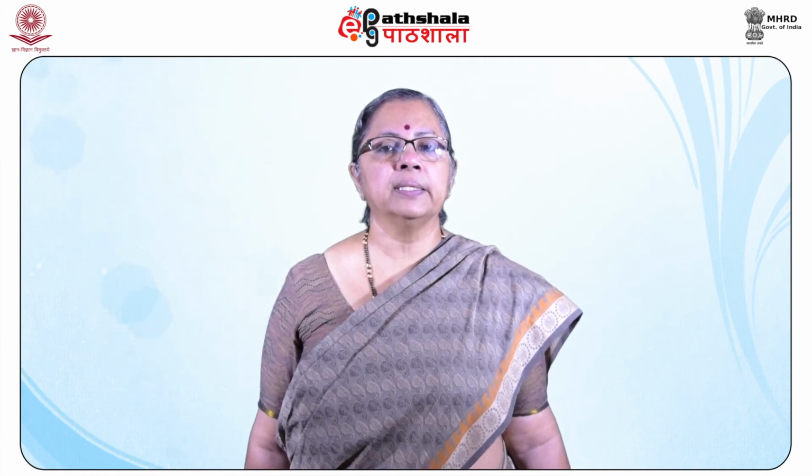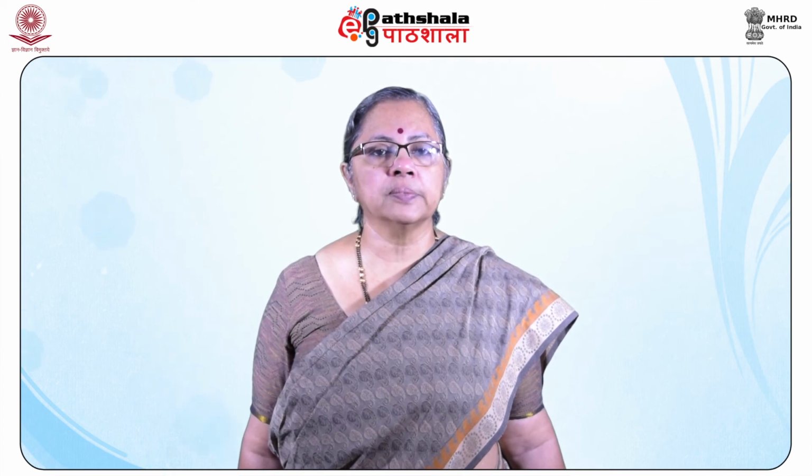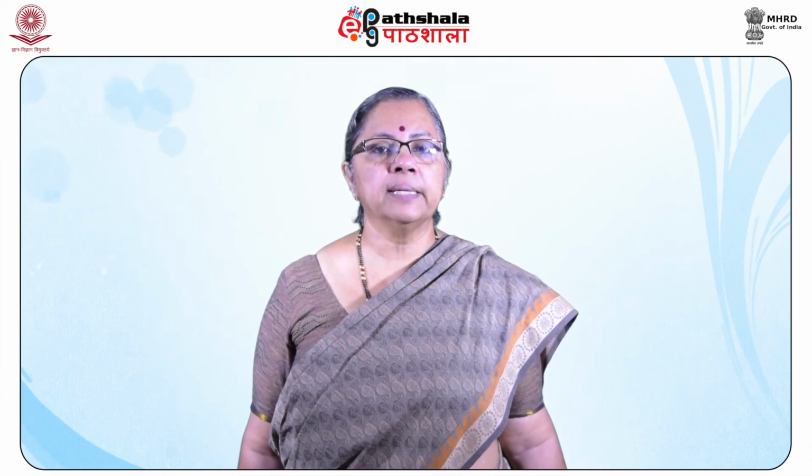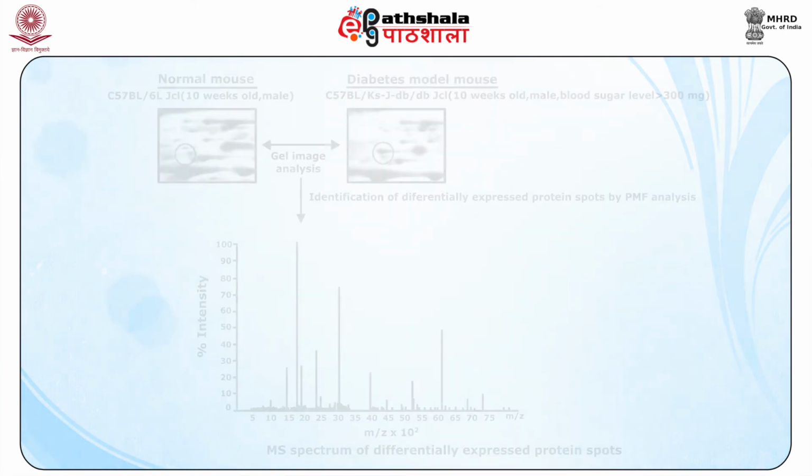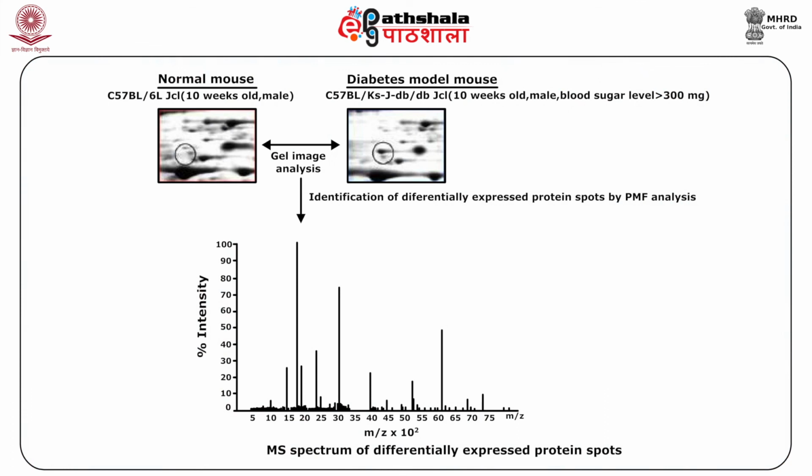Hence, the proteome can be analyzed by the molecular weights of the various proteins. Databases of various proteomes can be maintained and made available for comparison. The figure illustrates the use of mass spectrometry in analyzing a proteome.